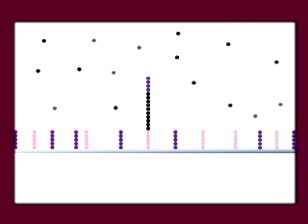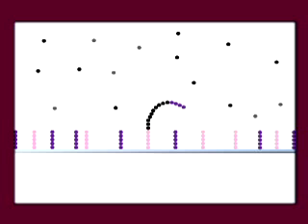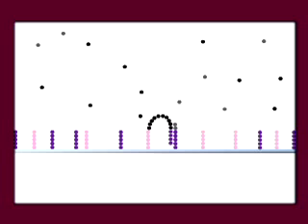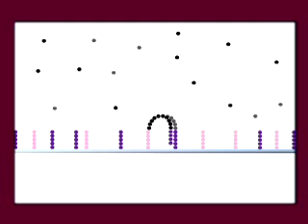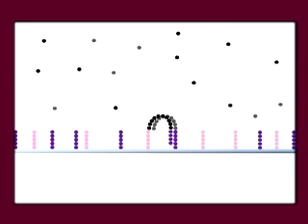The temperature is decreased so that the DNA stuck to the flow cell forms hydrogen bonds with the primer on the surface of the flow cell, shown here in purple, creating a bridge. Then a PCR reaction mixture is run over the flow cell. The temperature is increased and the polymerase makes a copy of the input DNA. The growing strand is seen in gray. We call this bridge amplification because the copying occurs in the arched region between the two adapter sequences.